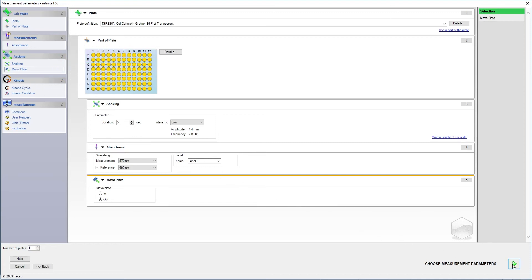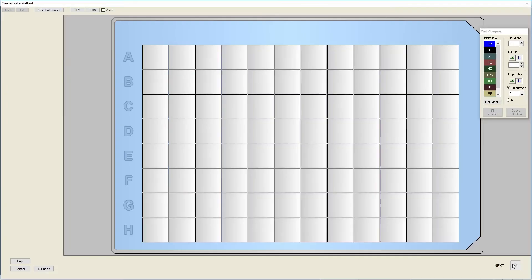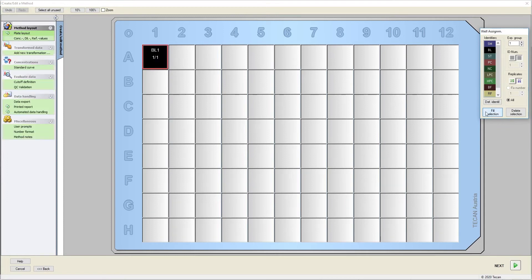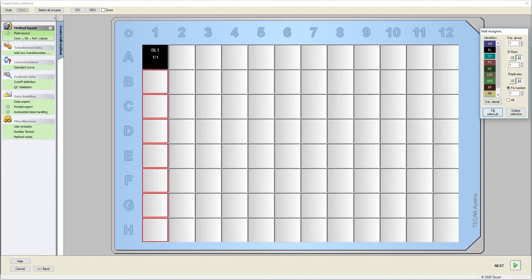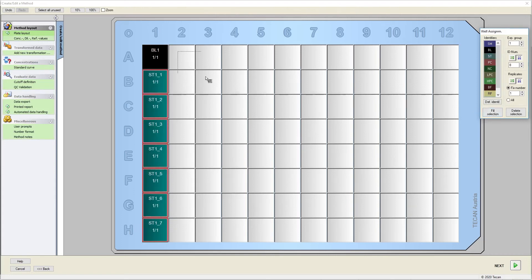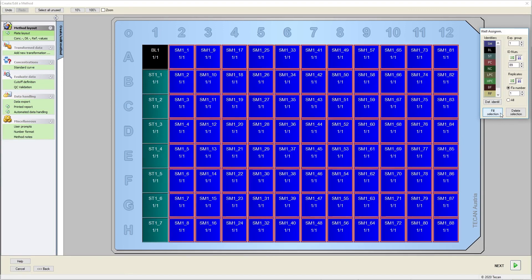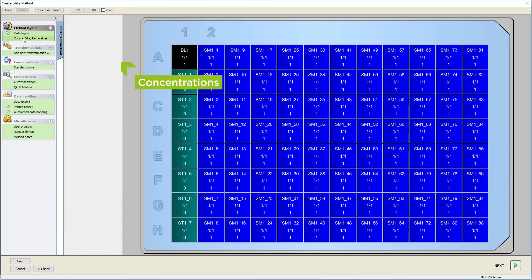With the parameters set, we now need to define our plate layout. You can define blanks, standards, or samples. You can also select more identifiers, like negative or positive controls. Once the plate has been defined, the concentrations of the standards can be entered here.